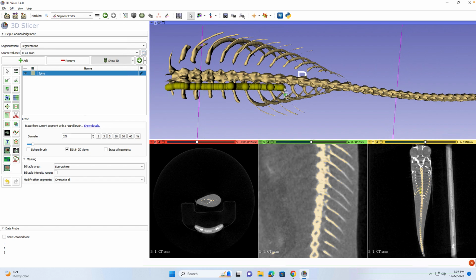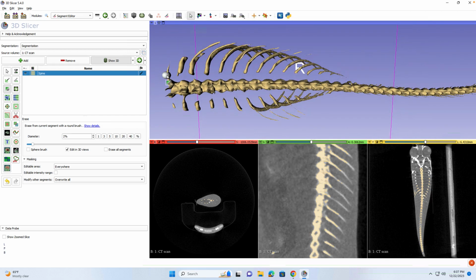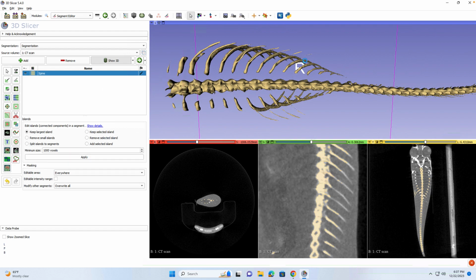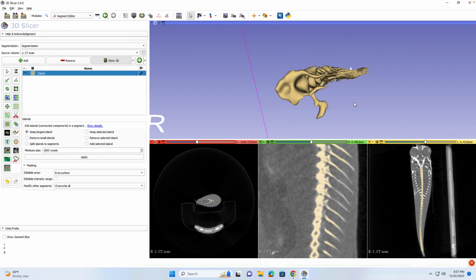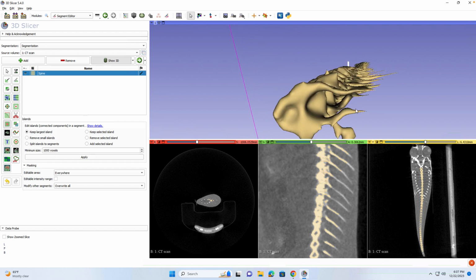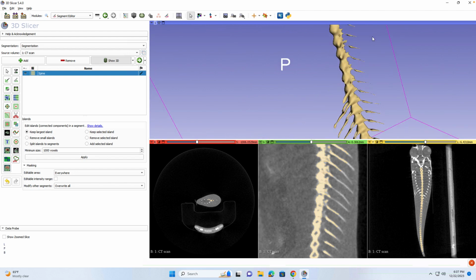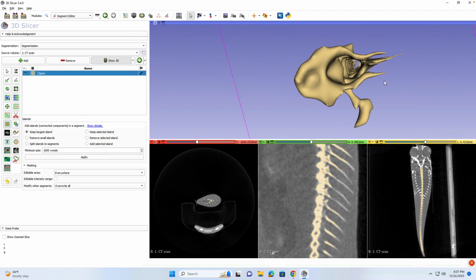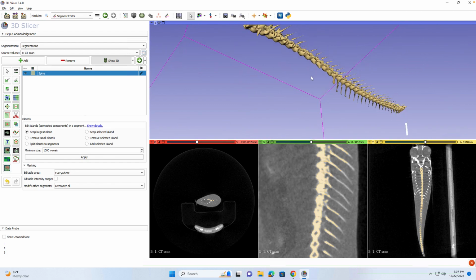All right, so it's going to convert those into little islands. That's exactly what we want. I don't know what that is. Okay, perfect. Come over here too. Go back. And right, we're getting smaller and smaller with it. So that probably was a really good place to start. Right, you can almost see, sorry, it's kind of bugging out, but you can pretty much see right down the spinal canal. So next thing we'll want to do is kind of clean up that top area.